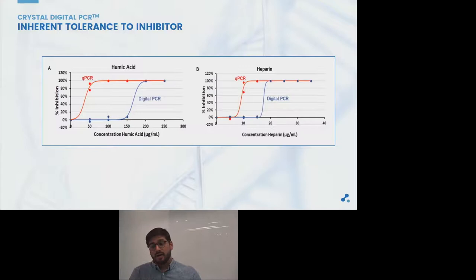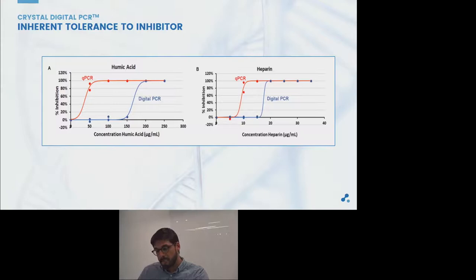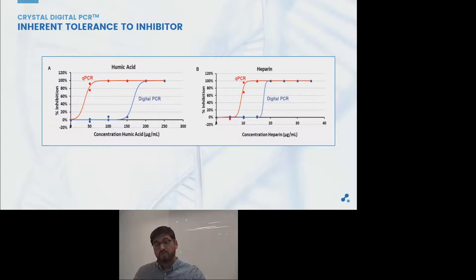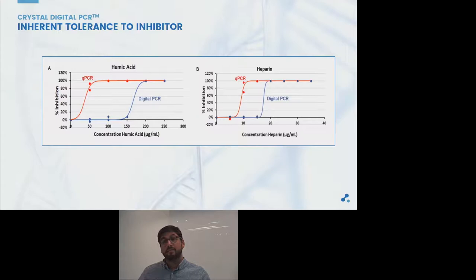Here is another graph showing on the y-axis the percentage of inhibition in qPCR and Crystal Digital PCR induced by humic acid or heparin, another well-known PCR inhibitor. In qPCR, we can see that inhibition occurs very quickly as the concentration of humic acid or heparin increases. In contrast, digital PCR is much more tolerant toward these PCR inhibitors, due to the digital endpoint data acquisition.